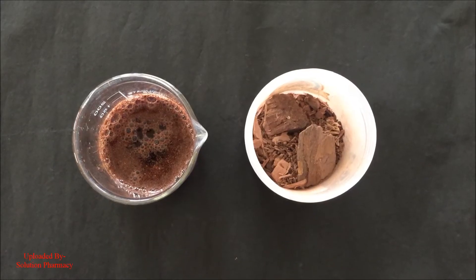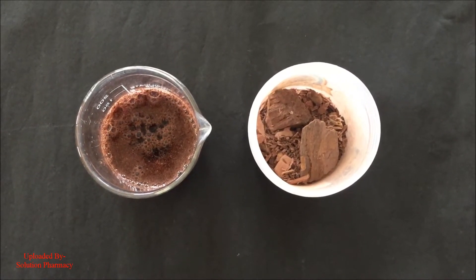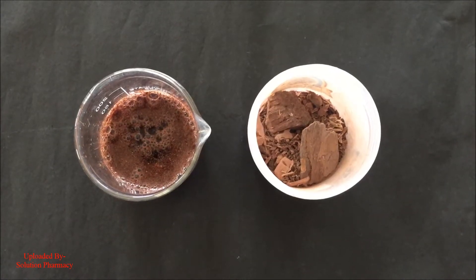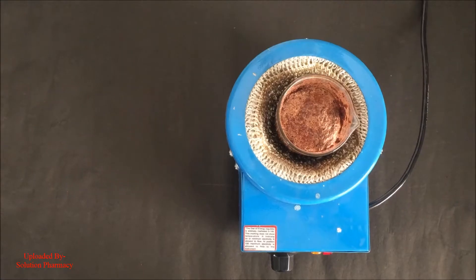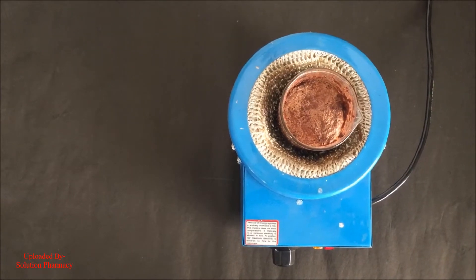Hello friends, today we will show you the procedures of different test methods which are applied for the detection of tannin in any plant material. Here we have taken arjuna bark which we have already poured and transferred into the beaker and then added sufficient quantity of water in it. Now boil the content of the beaker over the heating mantle for about few minutes to prepare the aqueous extract of the arjuna bark.